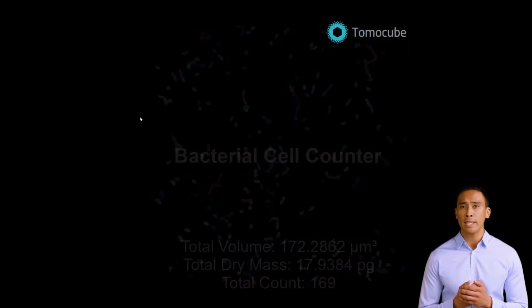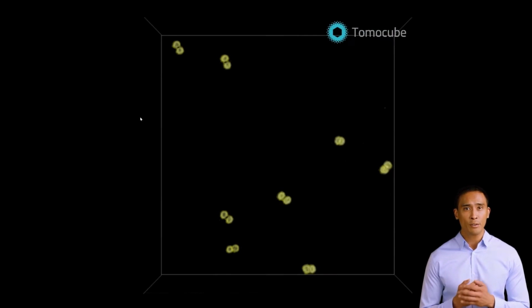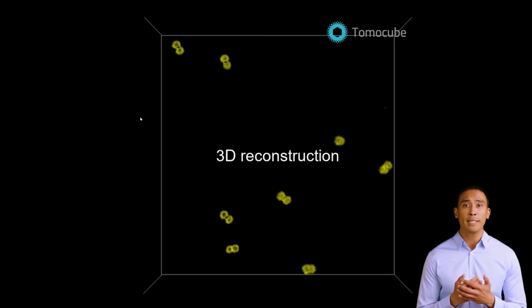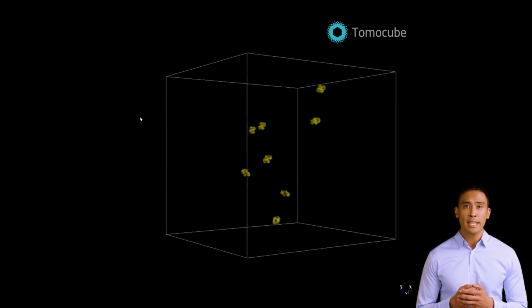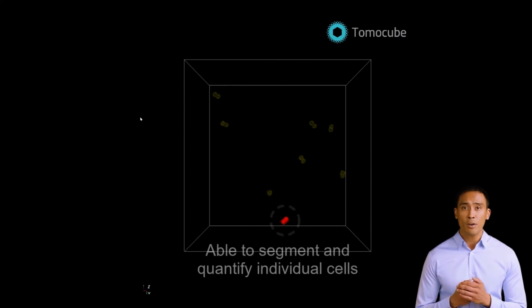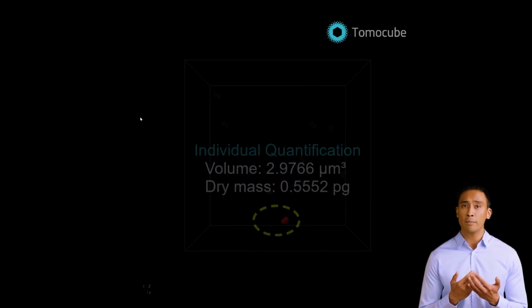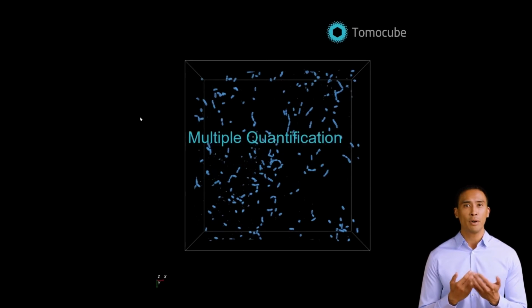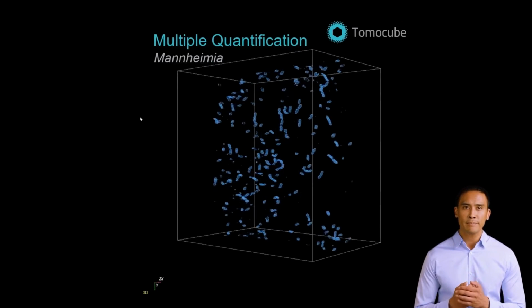An important feature of HT is not just 3D label-free imaging. It also provides quantitative information such as bacterial cell mass, volume, and concentration. For quantitative analysis, we also provide an automatic bacteria analysis toolbox. It enables the seamless and automatic workflow, including the measurement, segmentation, and quantification of various parameters of unlabeled live bacteria.